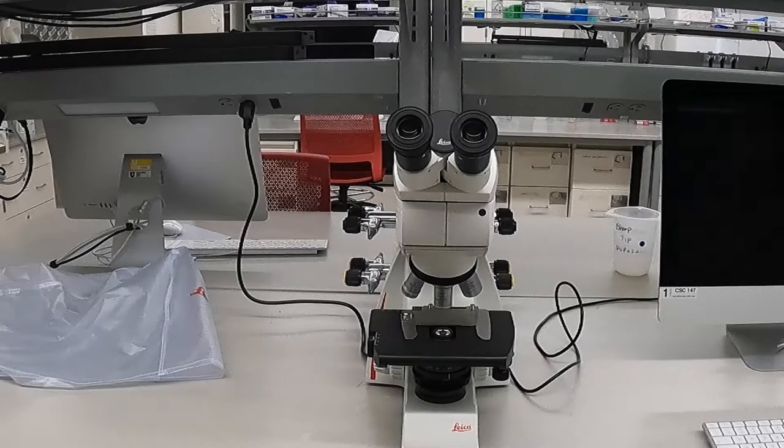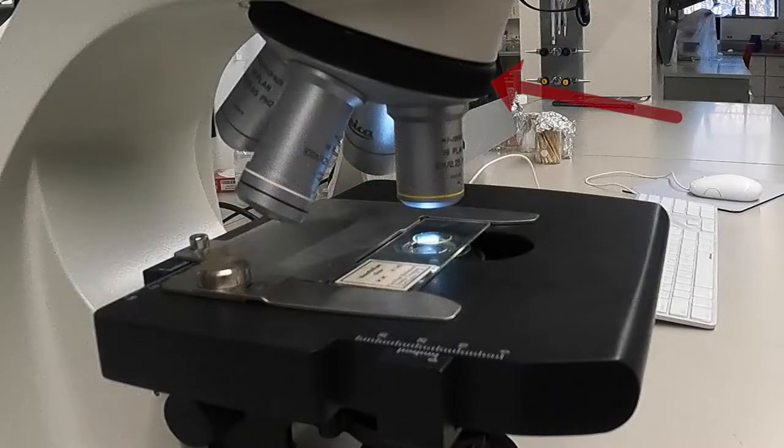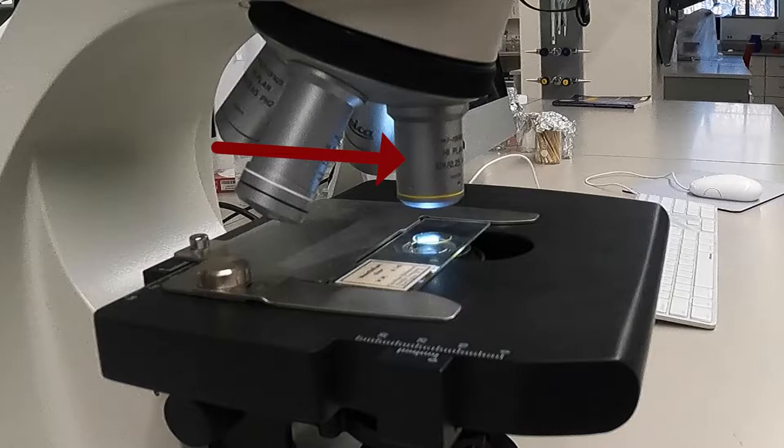Moving down from the ocular lens, we come to the revolving nose piece. The nose piece holds the objective lenses and each of these has a different magnification.